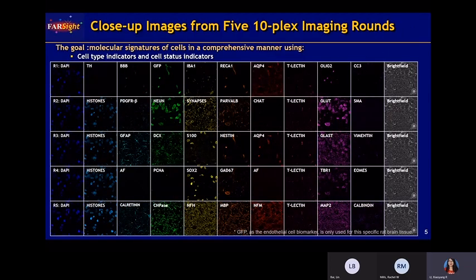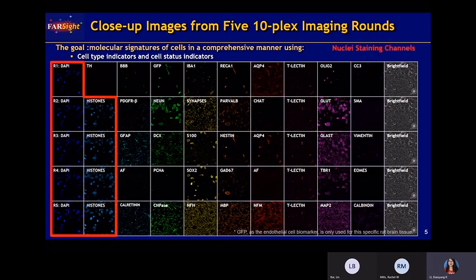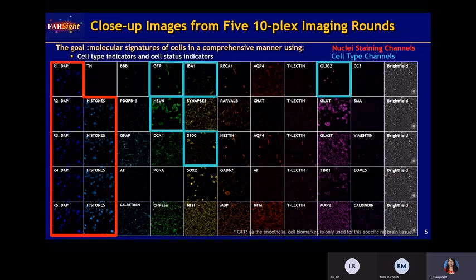Here is a close-up image of five 10-plex image rounds. It contains two nuclear stain biomarkers, DAPI and histone, and five cell type indicators for neuron, microglia, astrocytes, oligodendrocytes, and endothelial cells. The wash-and-restain step we mentioned is done manually, so when the lab technician puts the sections back on the microscope, misalignment is inevitable. However, we can deal with it — we stain the first channel DAPI in all five rounds, and this DAPI channel is used for registration.